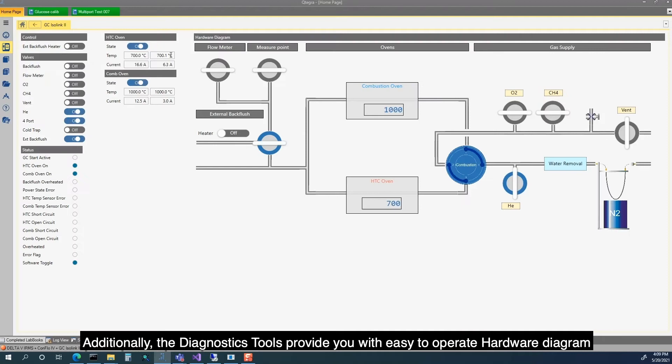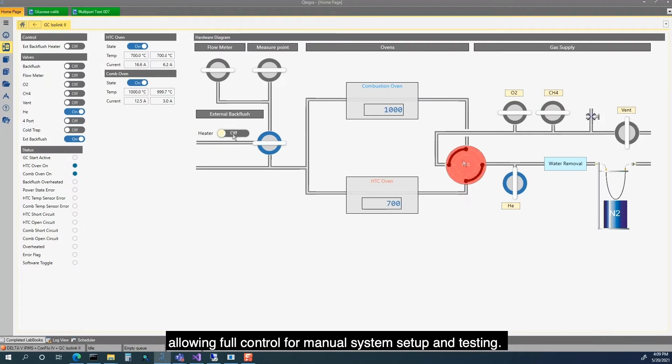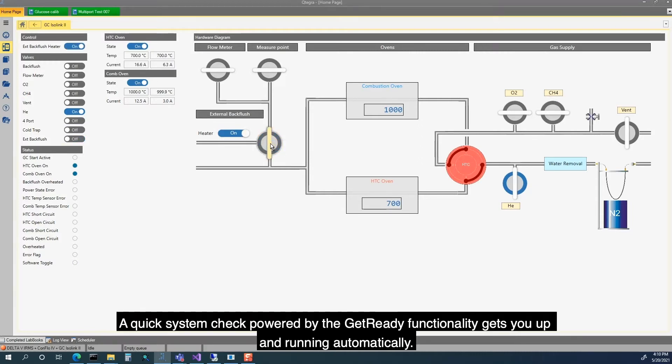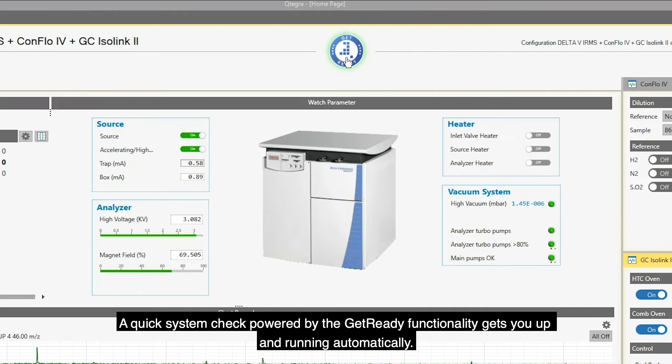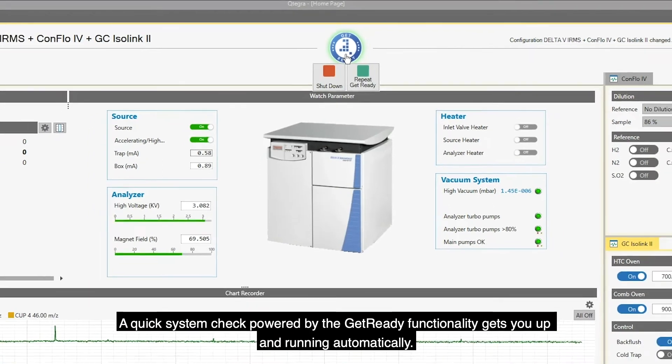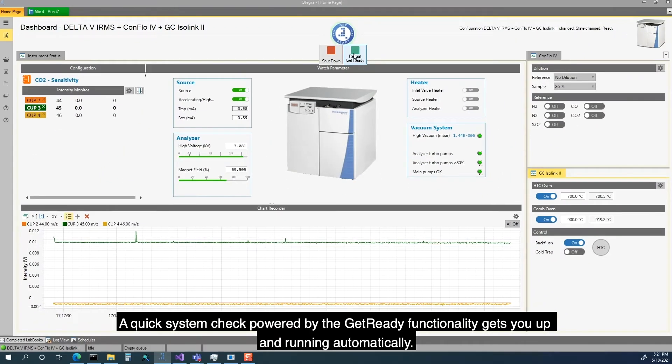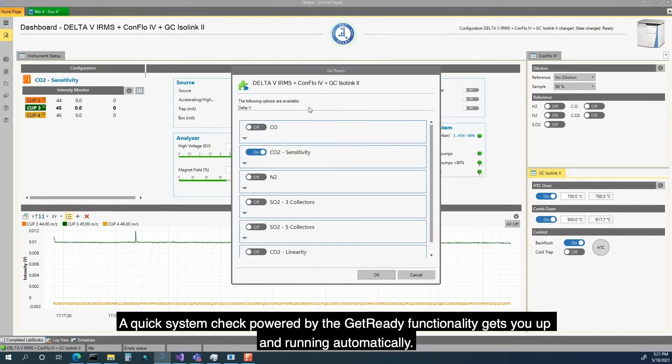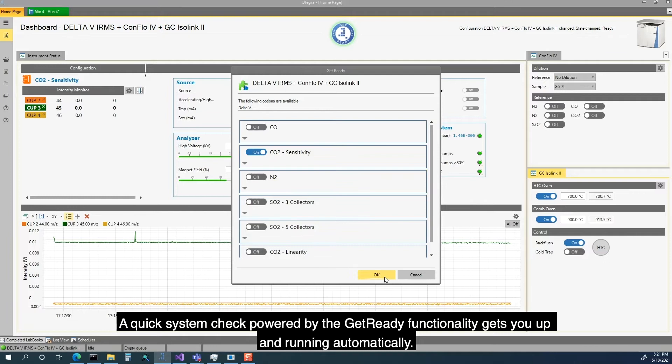Additionally, the diagnostic tools provide you with easy-to-operate hardware diagram, allowing full control for manual system setup and testing. A quick system check powered by the Get Ready functionality gets you up and running automatically.